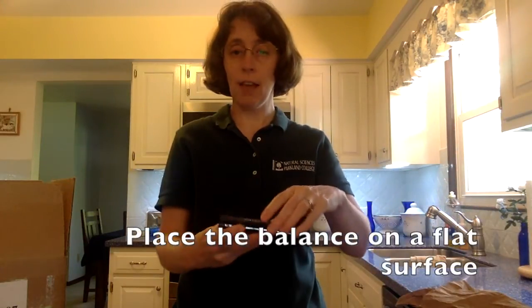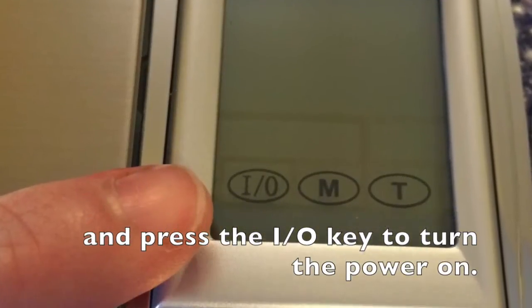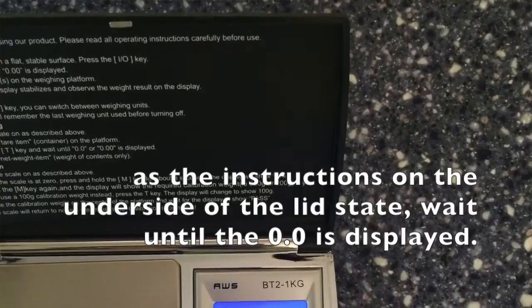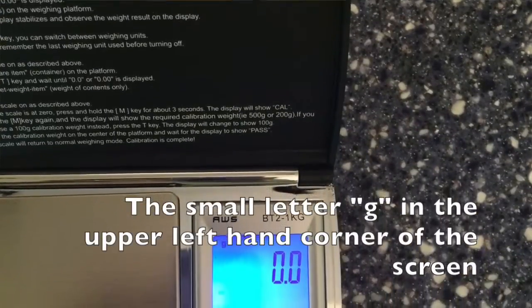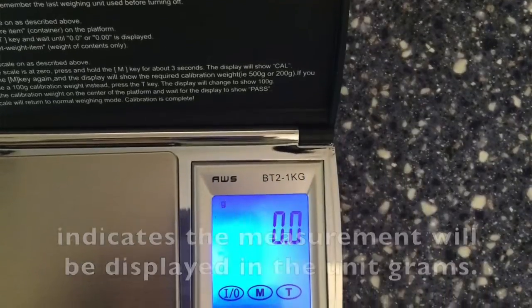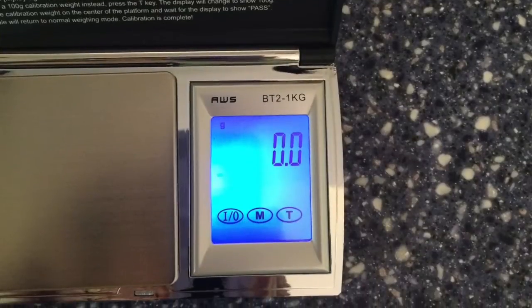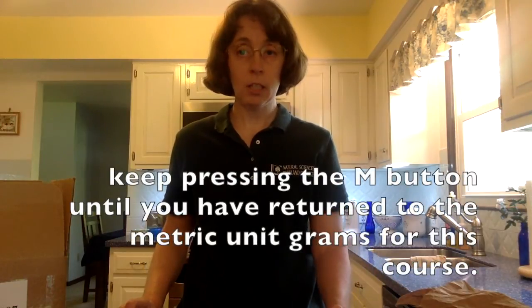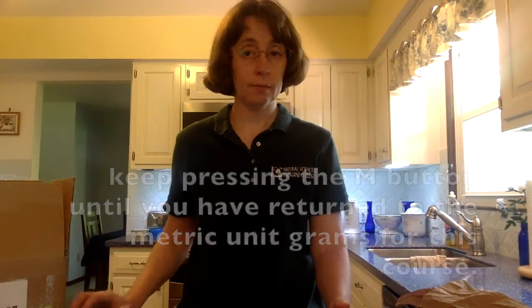Place the balance on a flat surface and press the I/O key to turn the power on. As the instructions on the underside of the lid state, wait until the 0.0 is displayed. The small letter g in the upper left-hand corner of the screen indicates the measurement will be displayed in the unit grams. If you don't see the small letter g in the left-hand corner, keep pressing the M button until you have returned to the metric unit grams for this course.